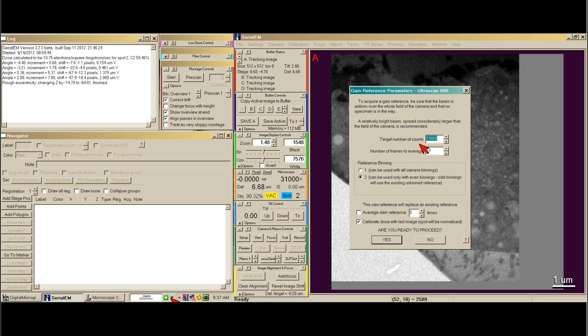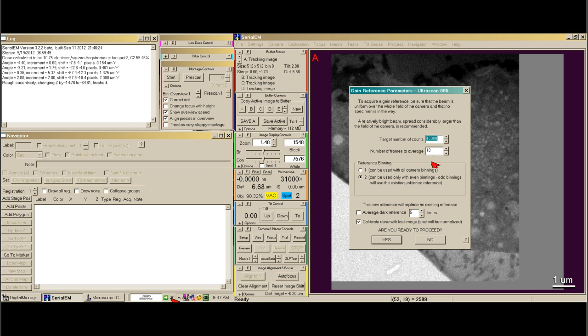Each camera will be different, but on our camera we need to target 10,000 counts. We usually average 10 frames simply because that will help with any x-ray events that happen during gain reference acquisition.